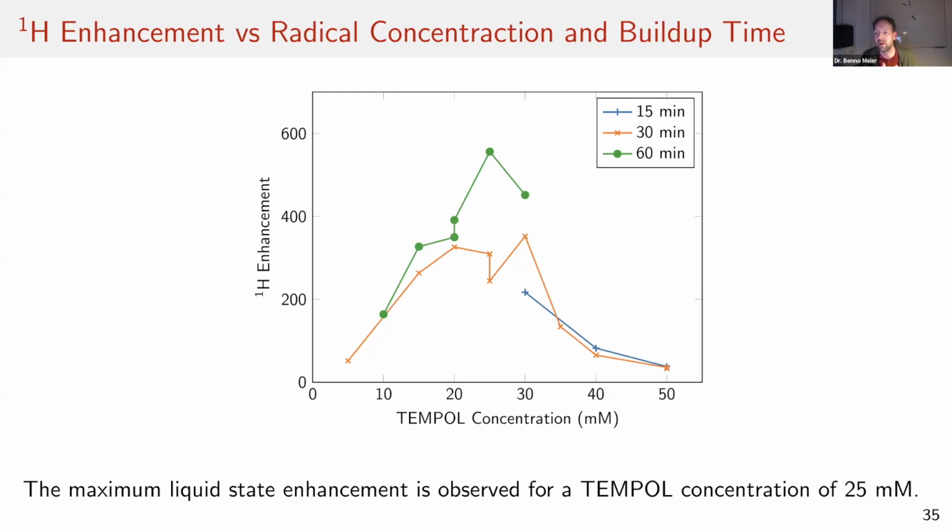So we are now preparing measurements with mixtures. And then the next step is to bring in targets, so a protein that these small molecules then can bind to and to observe that process. And the beauty of that would be is actually if you, with NMR, you can measure the binding strength of a ligand, but only in a range. So this binding strength is measured by a binding constant, which is given as a unit of a concentration.